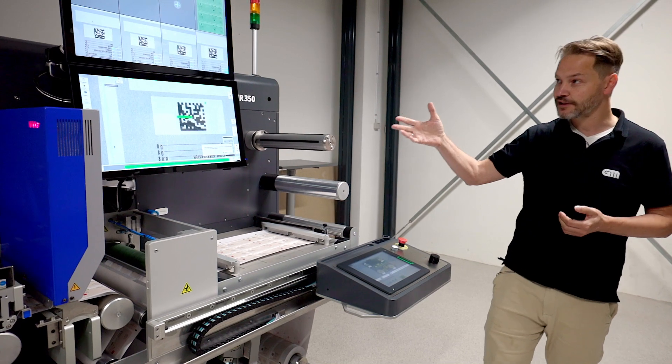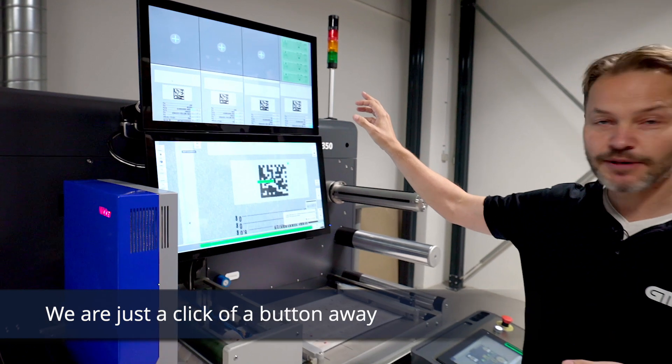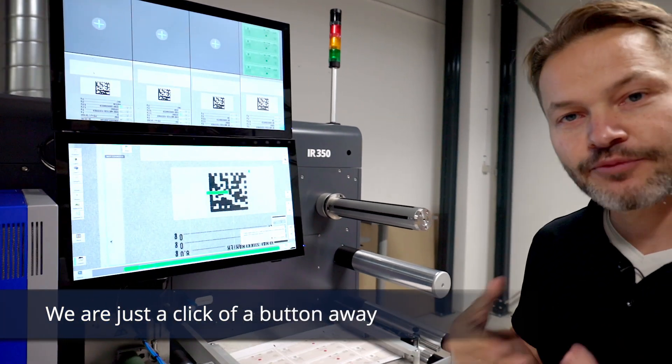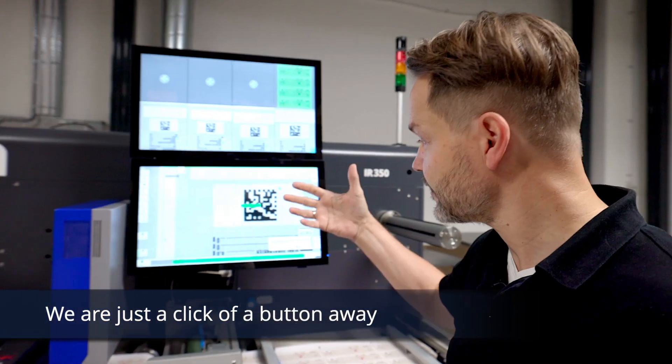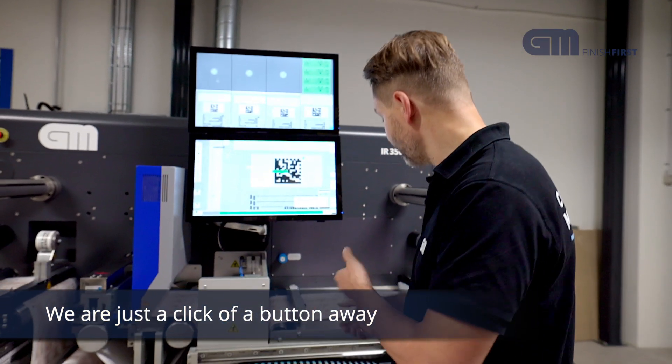The same goes for the camera system here. If you have a problem, simply press the assistance button, call up, and we can be there to help you see what you are seeing on the screen, making sure that your operators can get quickly on with the job.